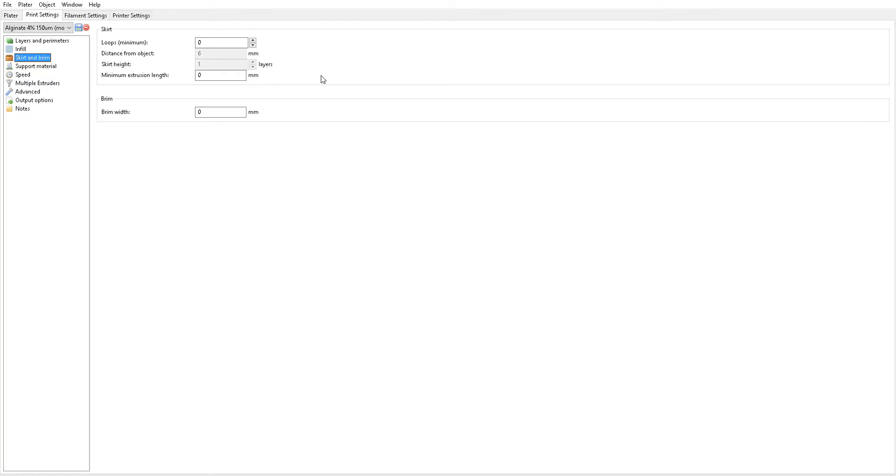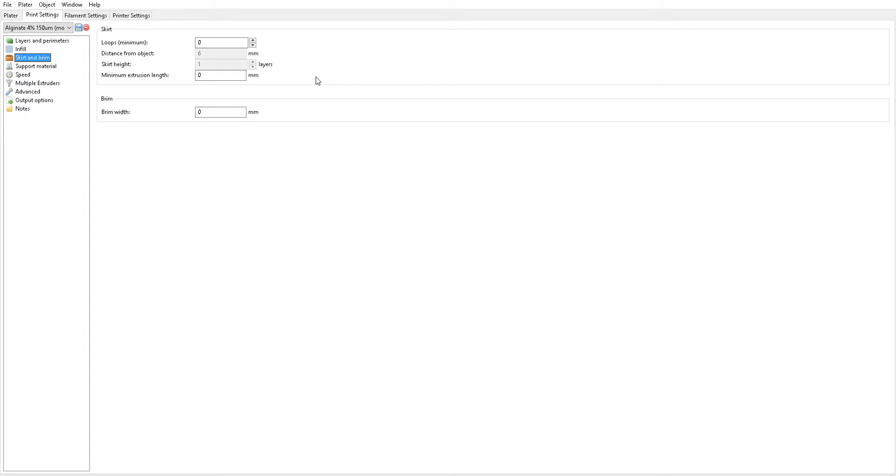For skirt and brim, this is totally up to you. So this is just to ensure, exactly like when you're printing plastic, that you have material flowing out of your needle when your print officially starts. Just like you do kind of like a purge of the extruder whenever you're printing plastic, it's the exact same for extruding a fluid. So this is just to make sure that you go around the perimeter of the entire print and are guaranteed to have fluid flowing by the time that your print officially starts. So it's not a bad thing to have, but sometimes it is a little unnecessary.